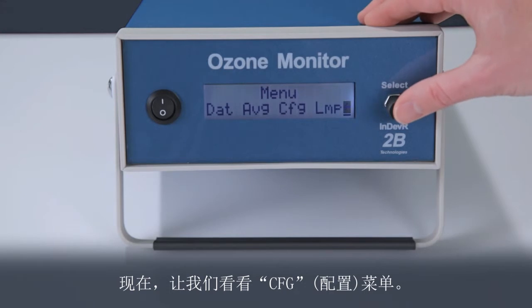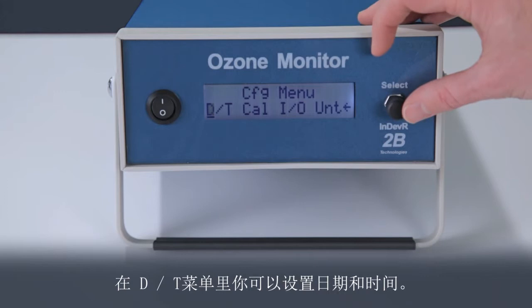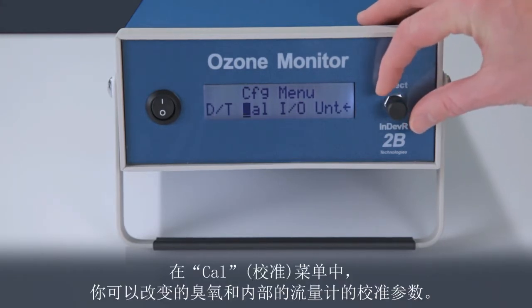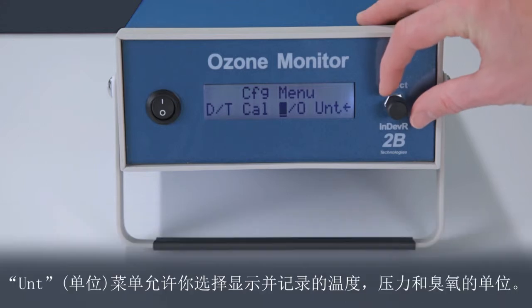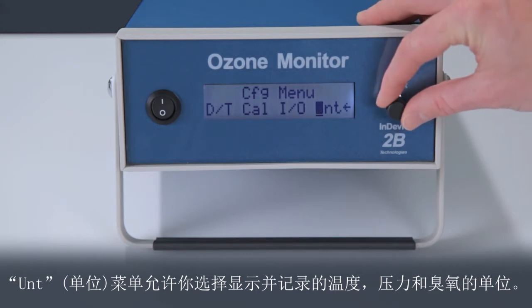Now let's check out the configuration menu. The DT menu is where you can set the date and time. In the CAL menu, you can change the calibration parameters for ozone and also for the internal flow meter. The I-O menu, for input-output, allows you to set the baud rate for data transmission to a computer, scaling factors for the analog inputs and outputs, see how many hours the instrument has been operated, and turn the display backlight on and off. The units menu allows you to select the units of temperature, pressure, and ozone that are displayed and logged.